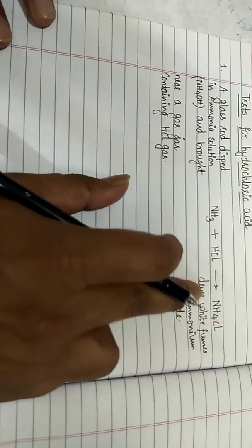So the observation which we get is dense white fumes of ammonium chloride.